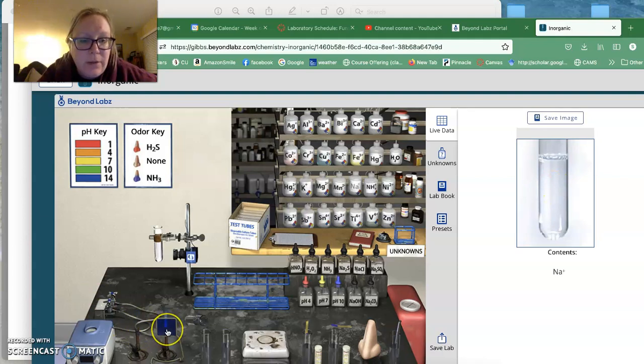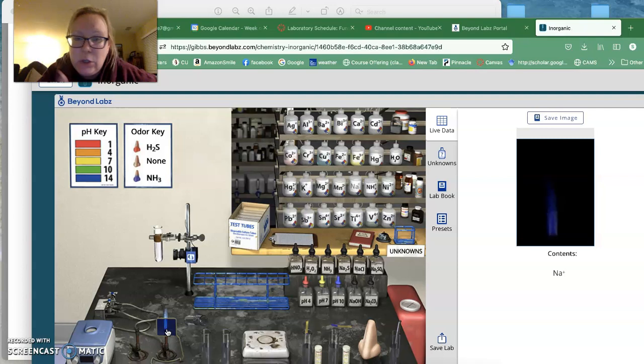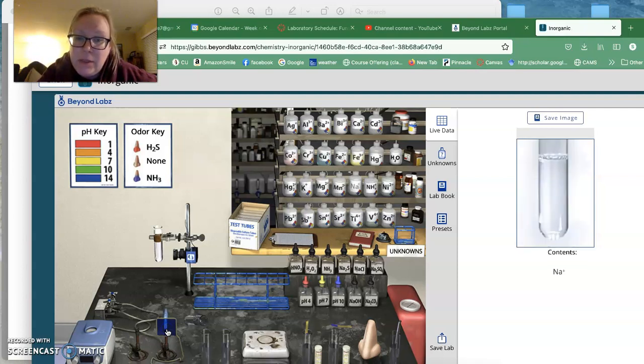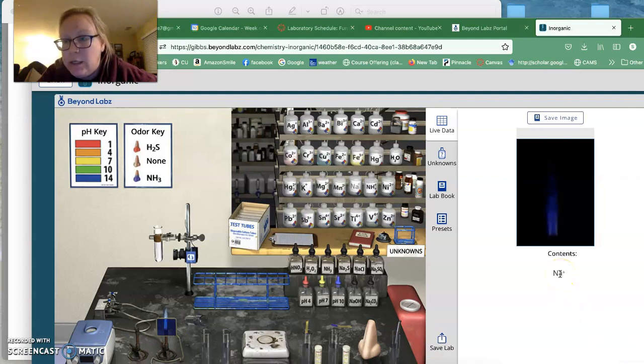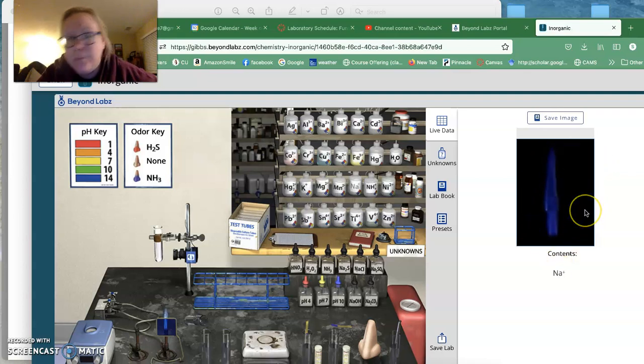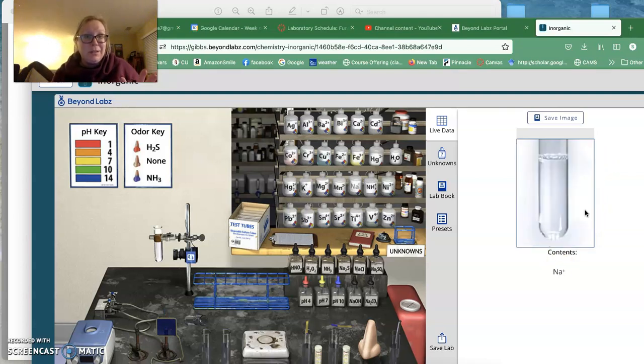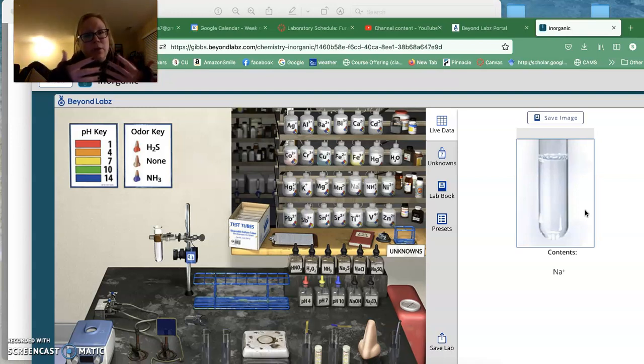And so that's the flame. Now, if you want to see the flame and there's the cobalt glass in front of it, that's where you click. And so you would watch over here. And now that same wire's there. And that's the color of the flame there. It's the same substance, right? We're just using the cobalt to help us separate out some of those orange colors.